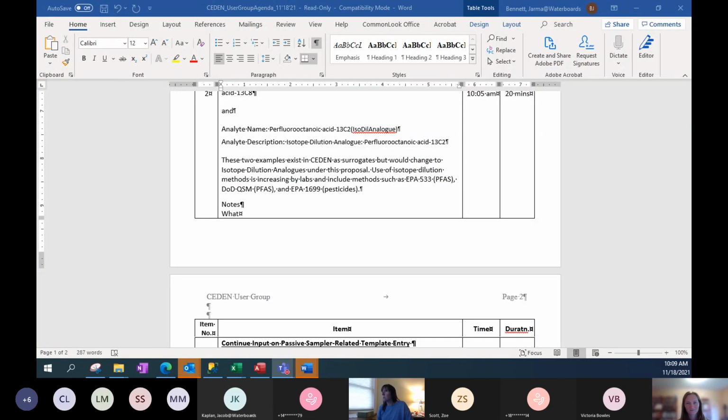to as an internal standard. So one thing I would say about this is, are you actually getting internal standards that are not used as an isotopic dilution analog, or are they the internal standards that are looking at process control, essentially instrument drift and sample to sample variation, which is what internal standards are typically used for, not for quantification correction. So that would be one concern that I would have, whether or not to include that information.